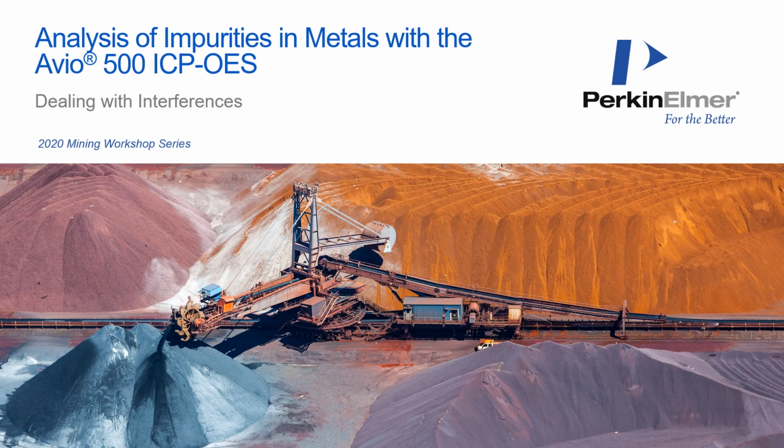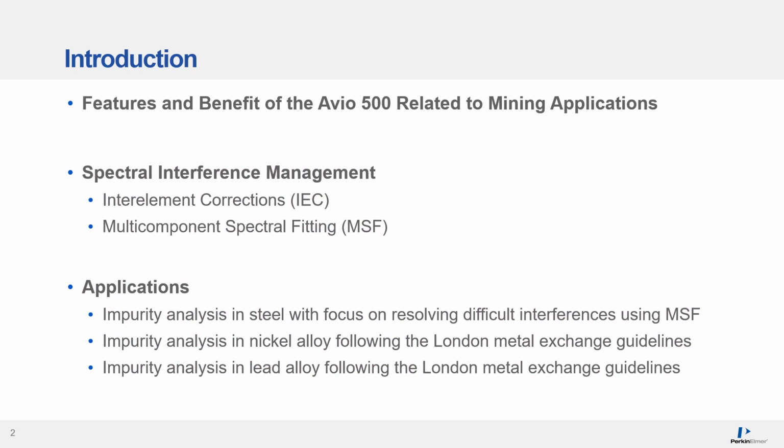In this presentation, we're going to talk about the analysis of impurities in metals using the Avio 500 ICP-OES. In this talk, we're going to briefly highlight the features of the Avio 500 and get into spectral interferences and their management in the world of optical emission spectroscopy. In this case, we're going to talk about Interelement corrections, or IECs, or Multicomponent Spectral Fitting, MSF.